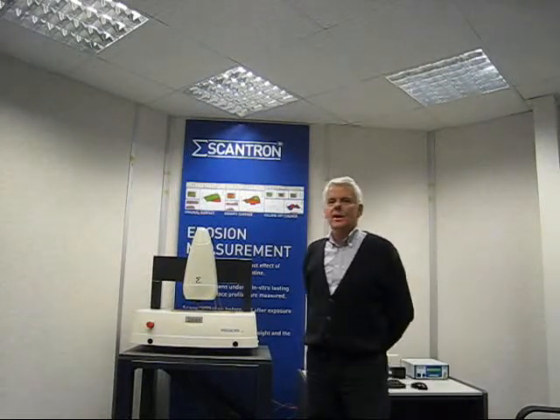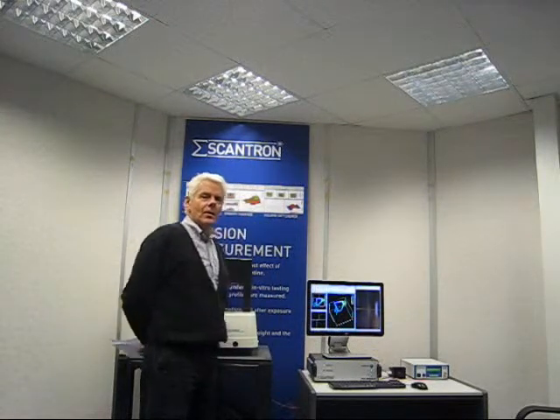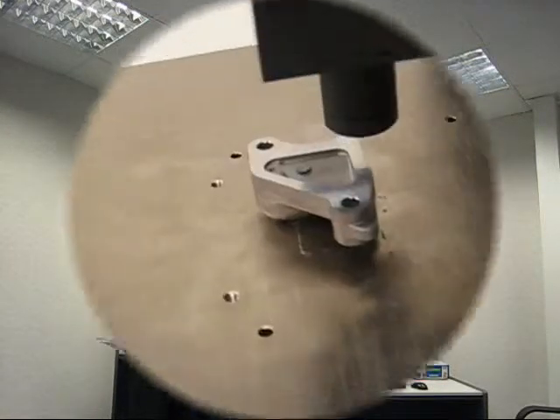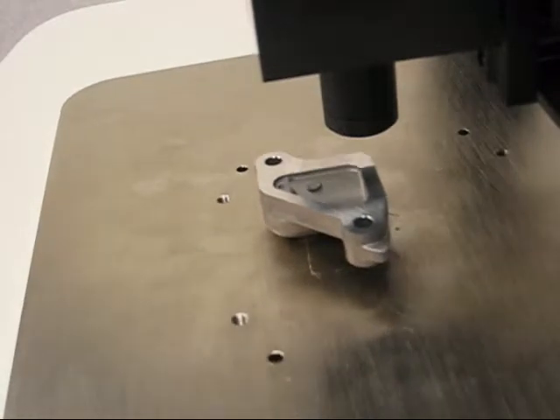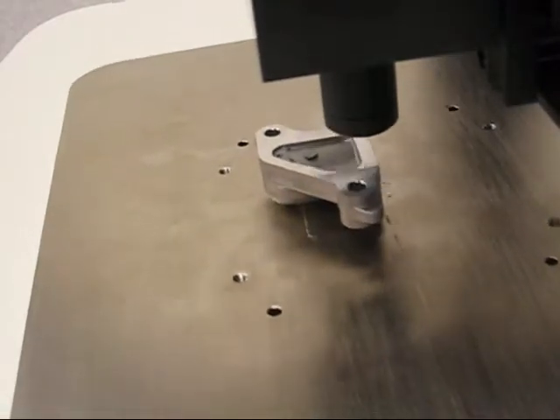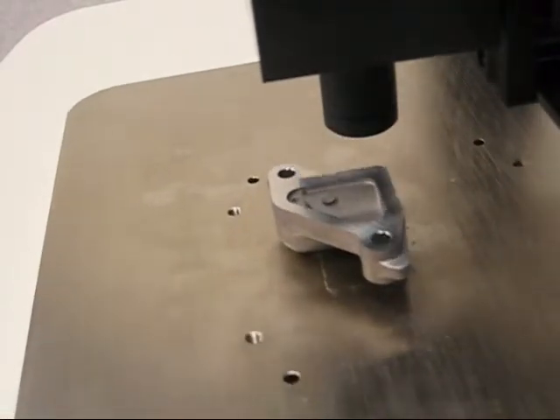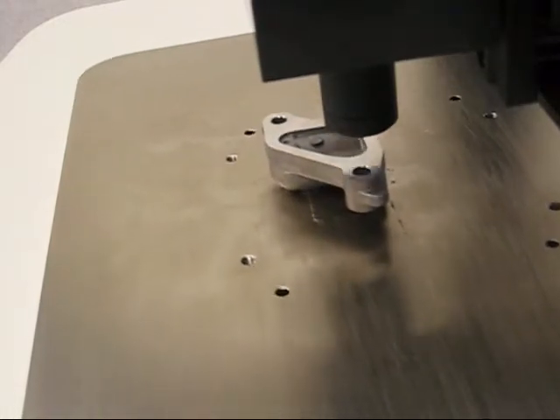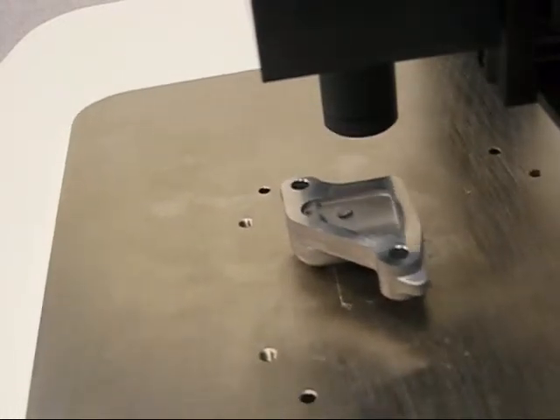This is a short demonstration of ProScan 2100 measuring flatness on a mechanical seal. Here we're using a chromatic aberration sensor with 10 nanometer resolution.